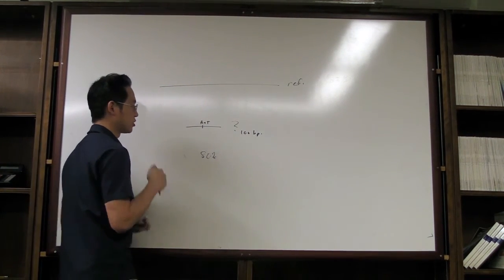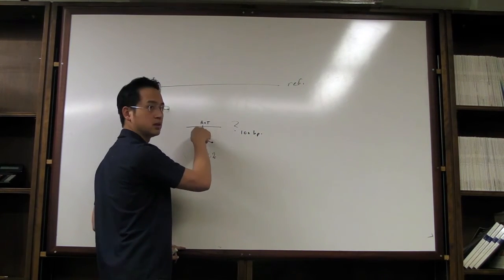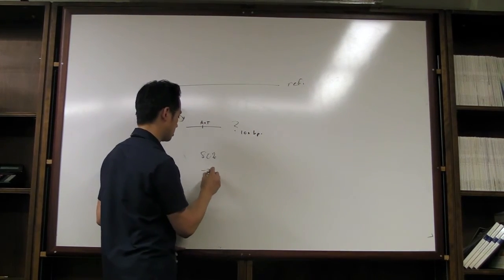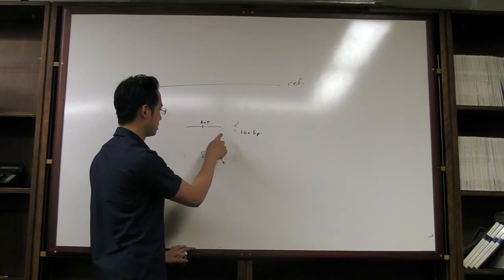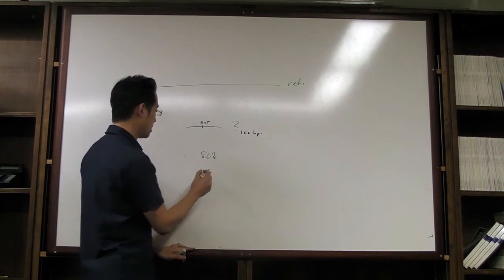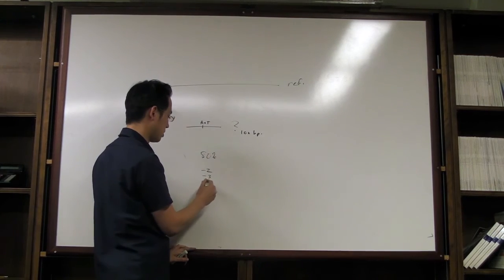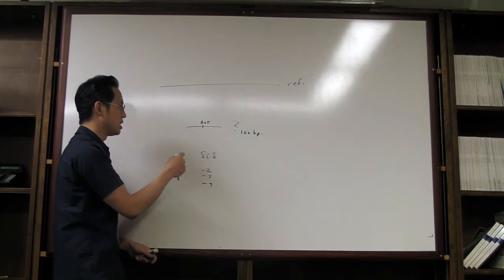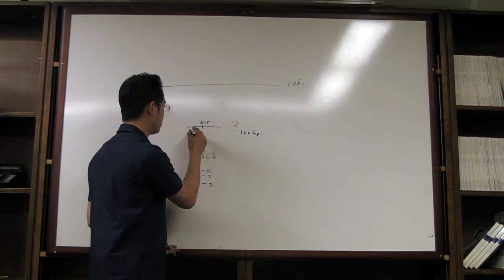And what they do is they have certain penalties. So if you have a base change that's different from the reference, then it's going to take away maybe 2 points. If you have something at the edges that's different, I think if I remember correctly, they take away 3 points. If you have an indel, so not only is a base change, but you have a deletion in here relative to the reference, maybe it's another penalty of 3. So they do different combinations of this, and in the end, they allow for some room for error, but then hopefully 80% of what's left.